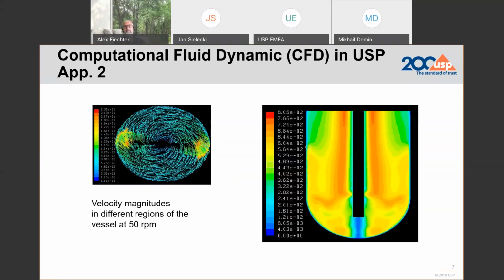So you will see differences in results just by visually looking at how this shape is occurring, and whether it's left-centered, right-centered, flat, or whatever. In our experience, you can immediately stop the test because you will have variances in results. How big? It's a question mark, whether it's still adjustable, up to you to define. But as a variability, I'm giving you an alert here.